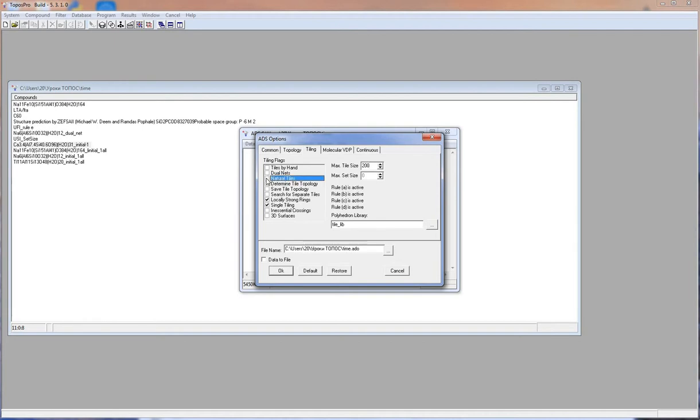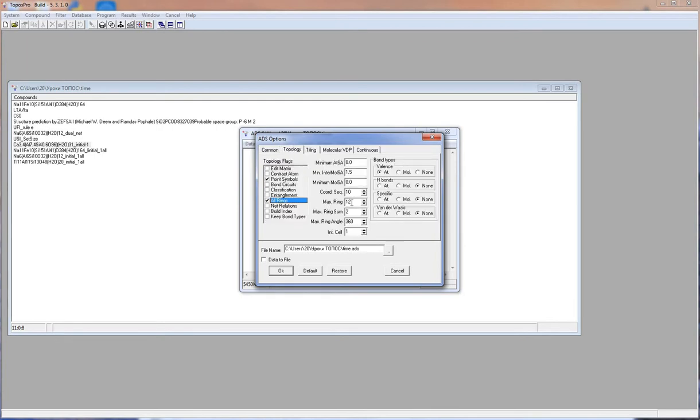I should check the Natural Tiles option. As you can see, the options Locally Strong Rings and Single Tiling turn on automatically. These 3 options ensure obedience of the tiling to the natural tiling rules. The rules and the algorithm for computing natural tiles are described in the supporting article. So I have set the options maximum tile size, natural tiles, locally strong rings, single tiling, and maximum ring, which are necessary for the natural tiling construction.